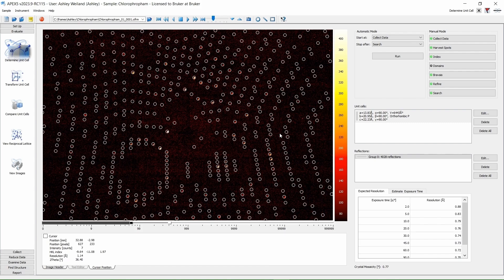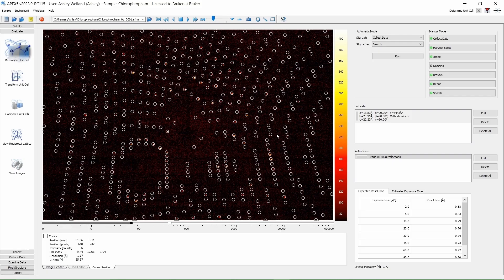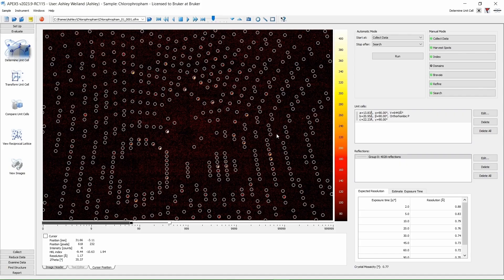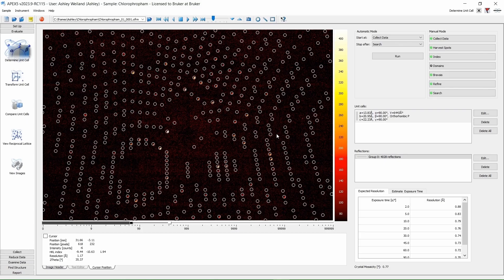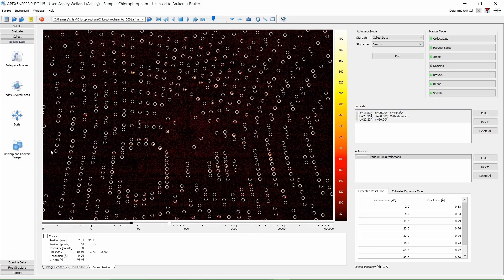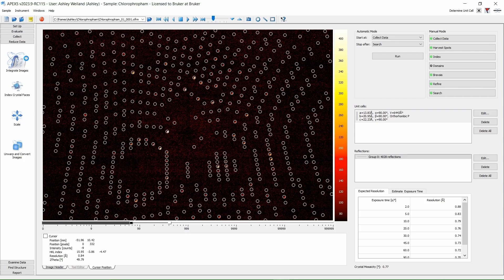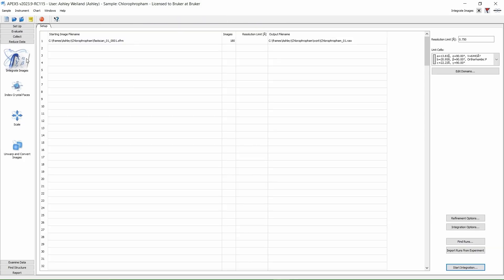Normally, we would go into Collect and determine a strategy for a full data collection, but I only need to know quick connectivity of this structure, so let's go straight to Reduce Data and Integrate Images. You can read in your 3-minute fast scan by clicking Find Runs or Import Runs from Experiment, then click Integrate.